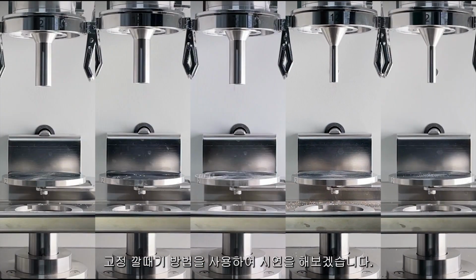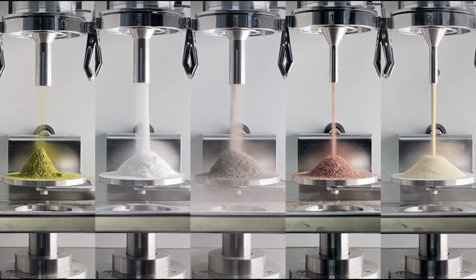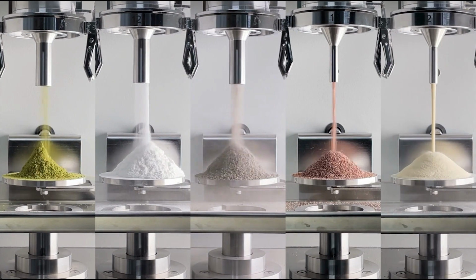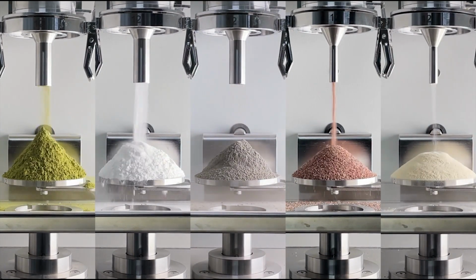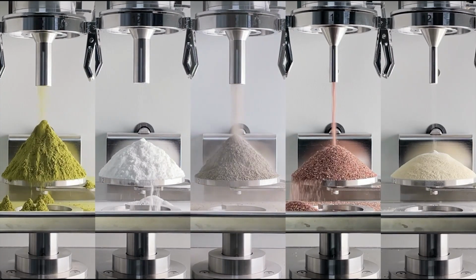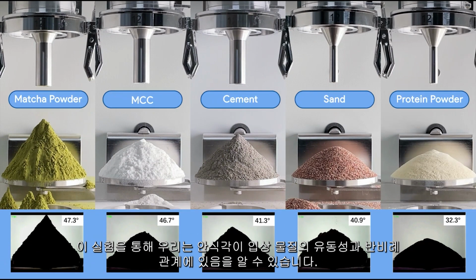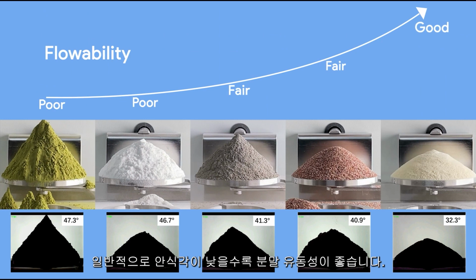Let us use the fixed funnel method to conduct a demonstration. From this experiment, we can see that angle of repose has an inverse relationship with the flowability of its granular material. Normally, the lower the angle of repose is, the better the powder flowability is.